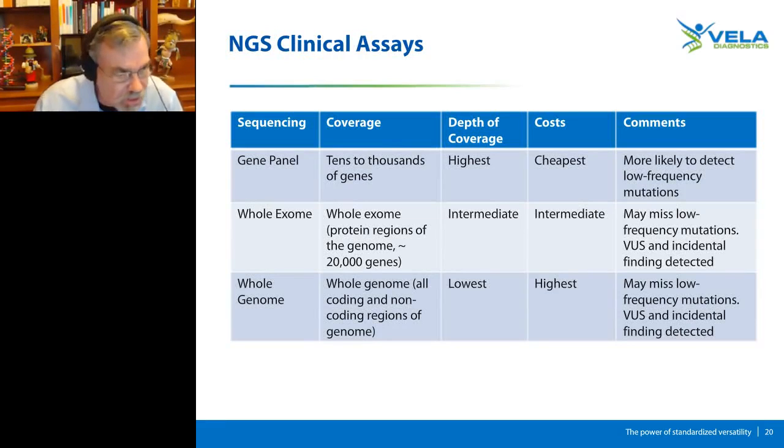So NGS, or Next-Gen Sequencing, has truly revolutionized the pathology analysis of tumors. NGS sequencing of tumors is the first time that we've been able to look at the nucleotide level of cancers. From the variants, we can associate genes, and from the genes, we can associate pathways to start to understand the complex nature of and the molecular biology of the tumors.